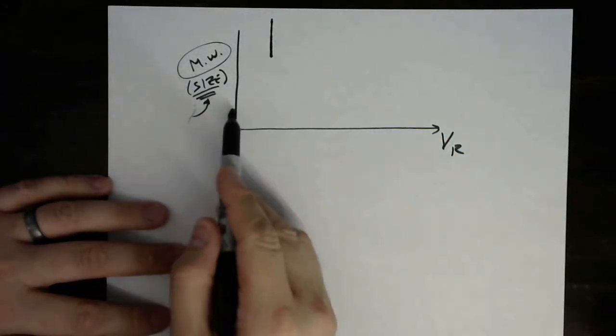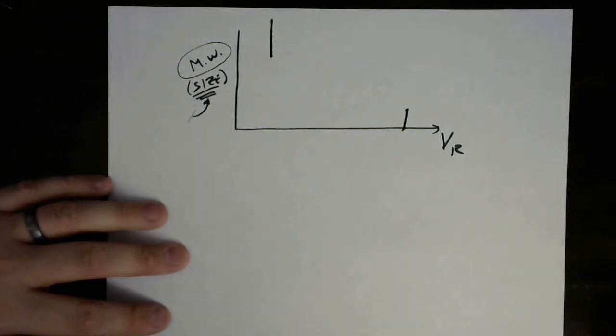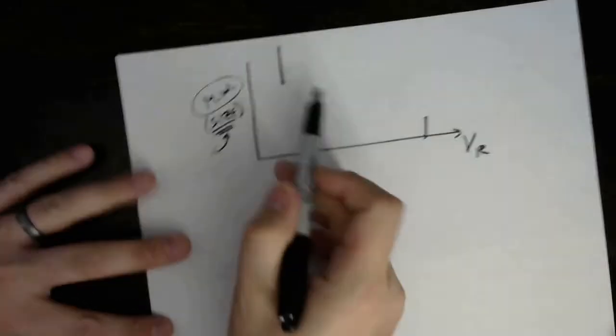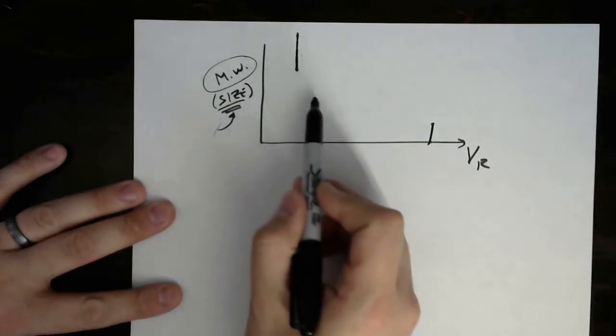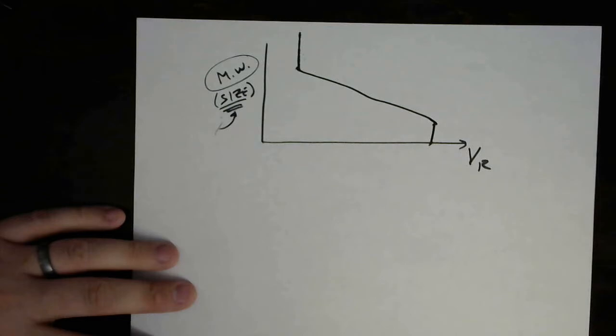There's some low end of this scale where everything samples all of the stationary phase pores. And so they all come out together. They all have the same retention volume despite having different molecular weights. But the space between them, we hope to have a nice linear resolving range between them.